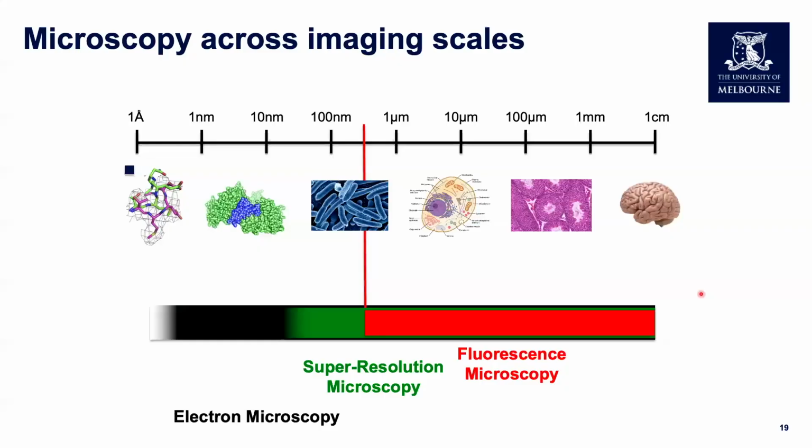And there are a number of different techniques that are available. I've chosen to divide it up based on size of sample. So here we can go from the model organism side of things, like fish and flies, whole bits of tissue from model organisms like mice, all the way down through tissues into cells.